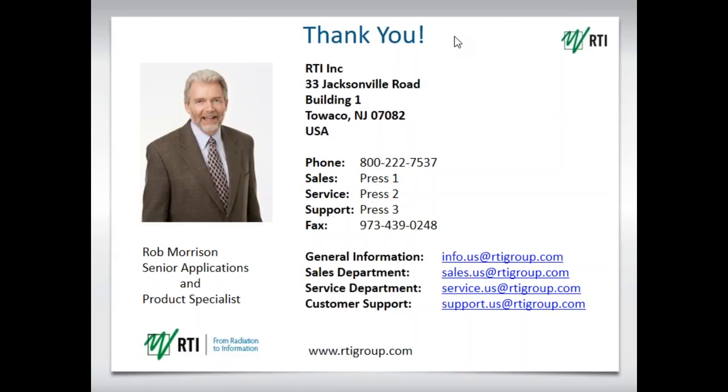Great. Another attendee would like to know, do I need an RTI meter to use the RTI Ocean software? The answer to that is no. However, you have to enter each of the parameters via keyboard, but you can use Ocean Professional with any meter, as I noted in the presentation. Just enter the measurements in by hand, and you can use Ocean Professional with any meter.